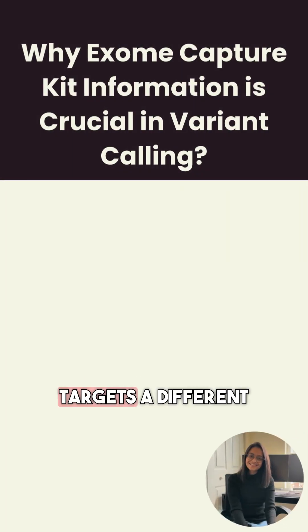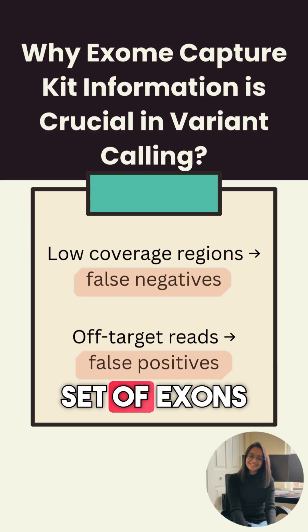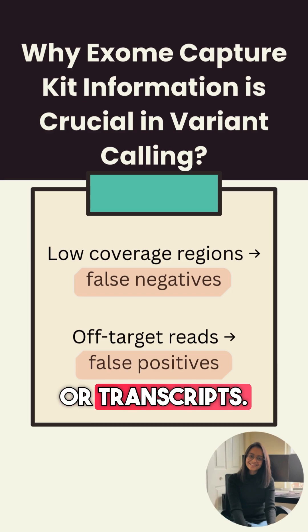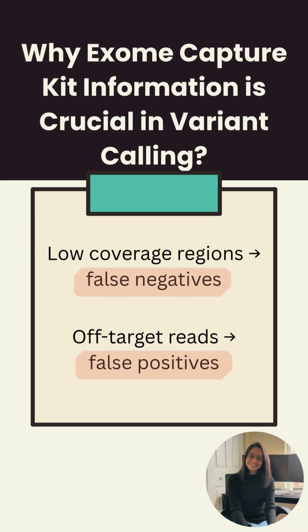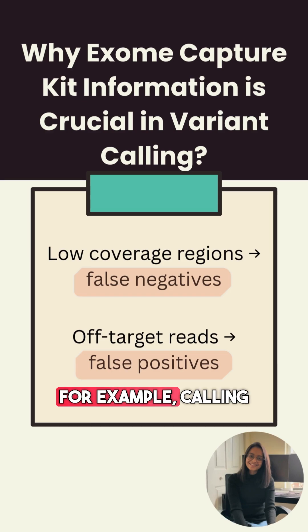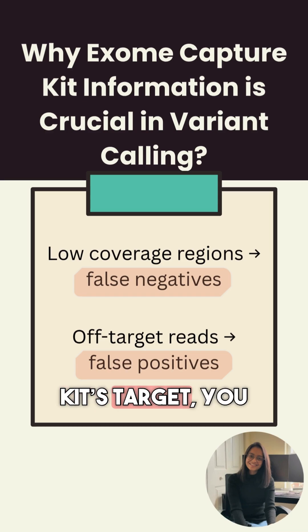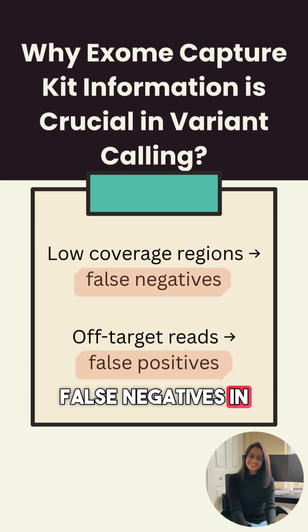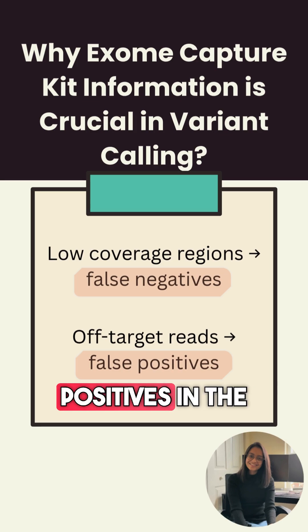Every exome kit targets a different set of exons or transcripts. If you use the wrong BED file — for example, calling variants outside your kit's target — you will be producing false negatives in the low-coverage regions and false positives in the off-target regions.